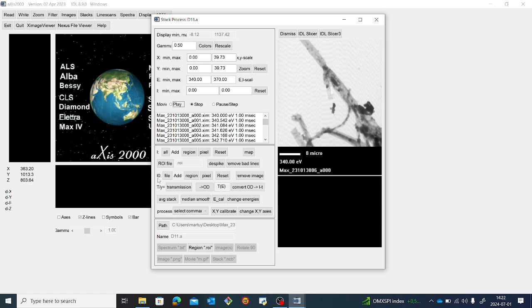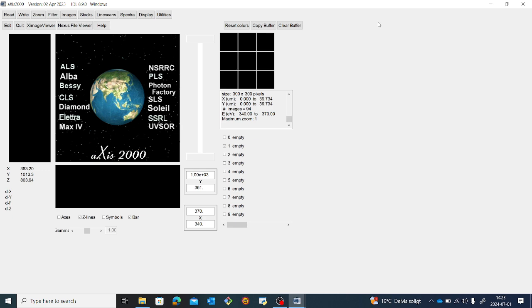To measure it, during sample preparation, you will need to leave an empty area on the silicon nitride or copper grid so that during the measurement, the light that passes through that empty area will be considered as the I0. These are the two values that you need to calculate the optical density from the transmission data. But first of all, we're going to see how to estimate this I0 from your samples if you have it in your image stack. I close this widget.